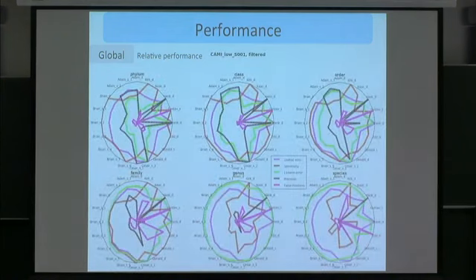Okay, so let's go ahead and look at these. So this is for the low sample, and the low sample is the one that had the most submissions. There was only a single file in there, so everybody knew how to run it and all that kind of stuff. In phylum, class, order, family, genus, species, once again, those same sort of observations that we saw beforehand, like notice the black lines right here, precision, higher is better, and you can see the black line slowly disappear. Once again, this one right here has pretty awesome precision at every single different level. Another is tied, and then it starts to drop off at the lower taxonomic ranks.